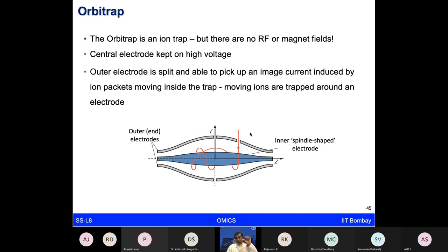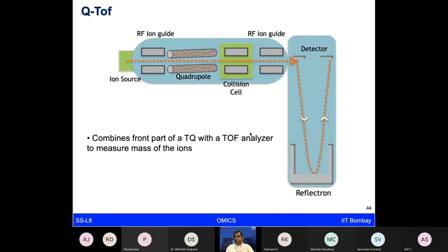Now let me take a minute to step back and give you a bigger picture. In a tube, we have 10,000 proteins, and we have digested them with an enzyme like trypsin. We now get maybe 50,000 or a million peptides. Those peptides are in liquid form, and we inject them from liquid chromatography slowly, and they get converted to the gaseous ionized form using electrospray ionization. From there, they come to these mass analyzers, the different types of mass analyzers I just showed you. And then you try to separate those complex ions, which eventually give you a peptide sequence or protein sequence.